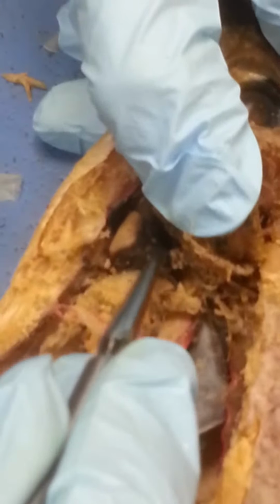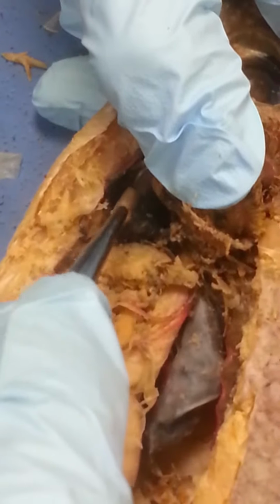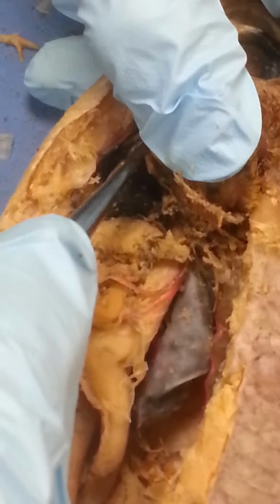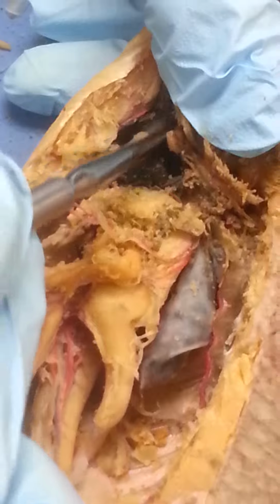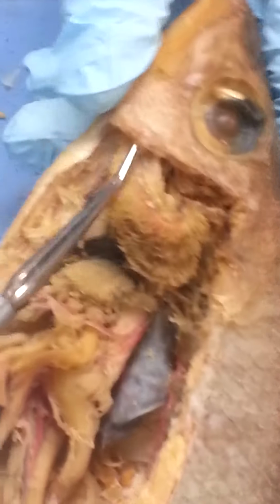This is your atrium. Right before your atrium is the sinus venosus. Then you have your ventricle and your bulbus arteriosus. That literally looks just kind of like a bulb. Then it goes into your ventral aorta, and then your afferent branchial arteries.